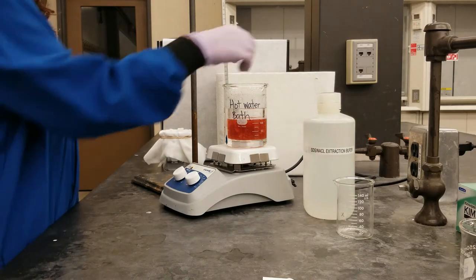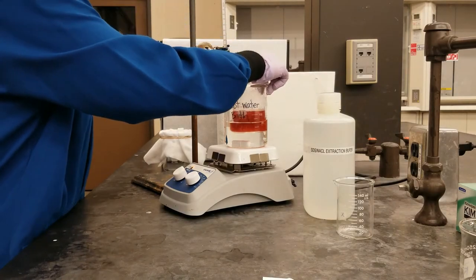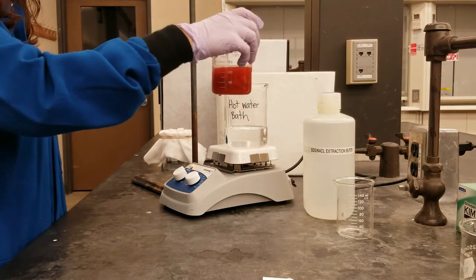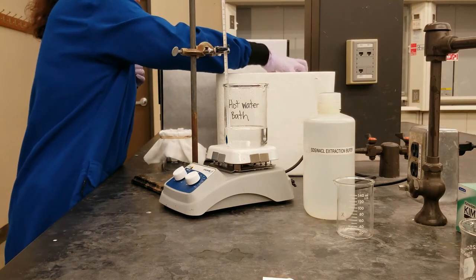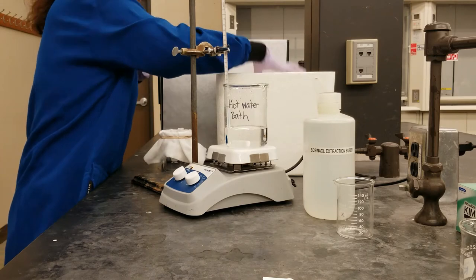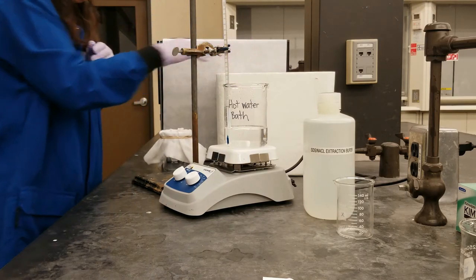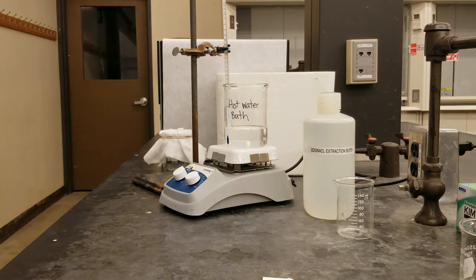Now that the 10 minutes are up, we're going to take our beaker out of our hot water bath and carefully place it into an ice bath. And we'll let that go for another 10 minutes.